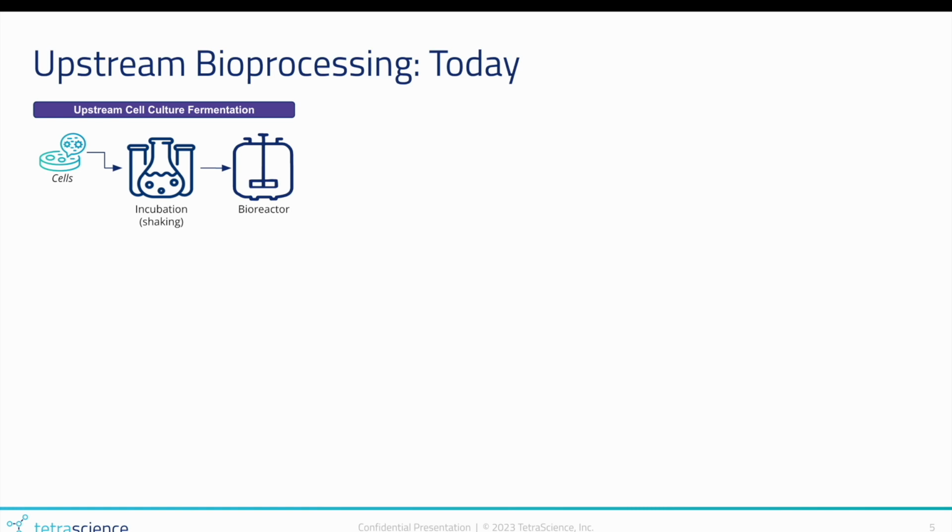Cell culture fermentation begins with a starter culture of cells. These are fed into various bioreactor vessels where different conditions can be used in order to try to find the best solution and best parameters for growing and optimizing your protein yield.